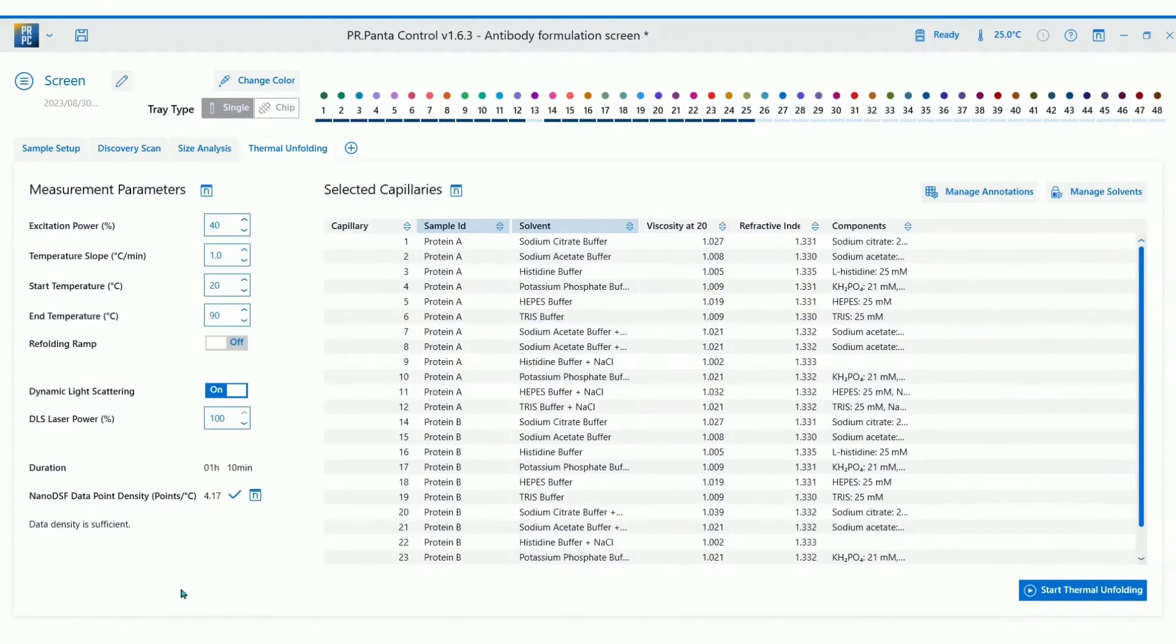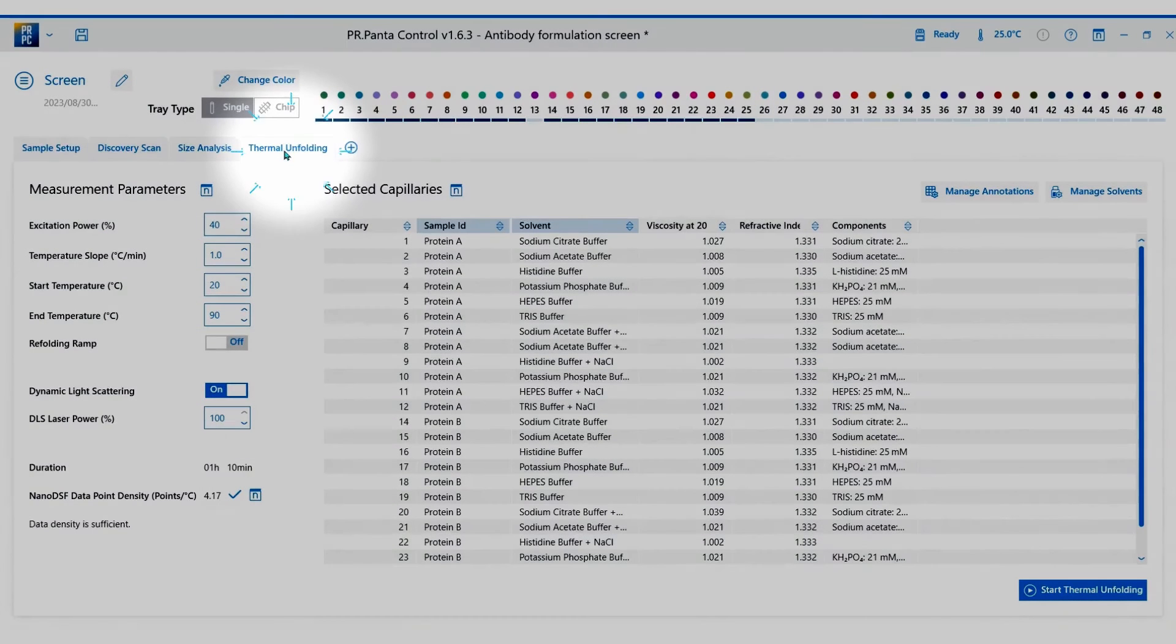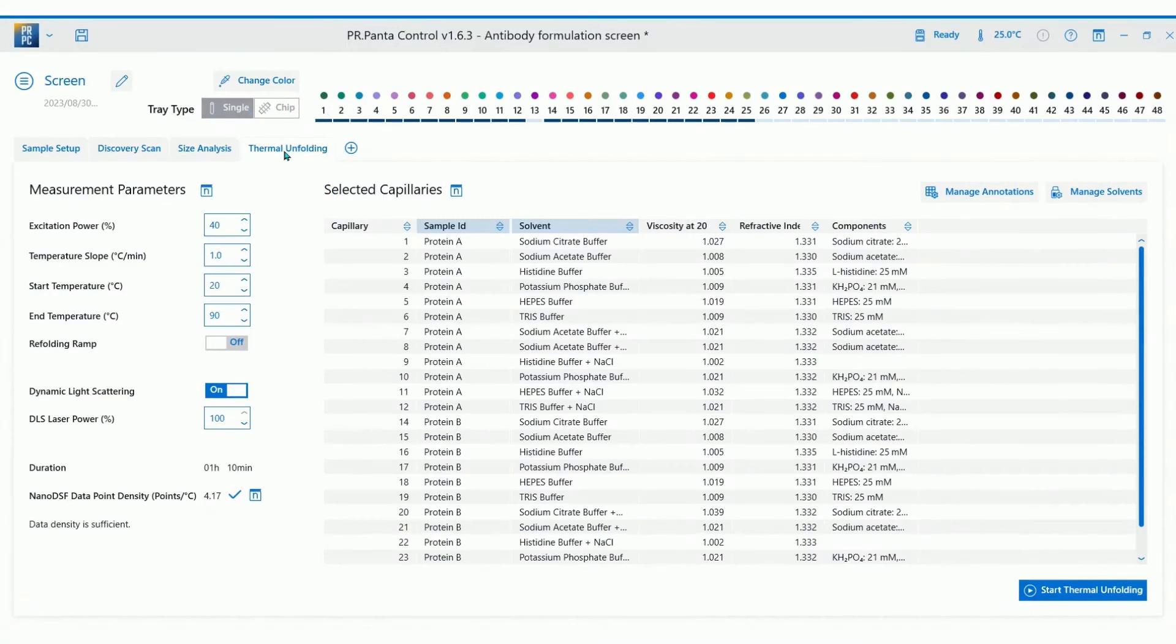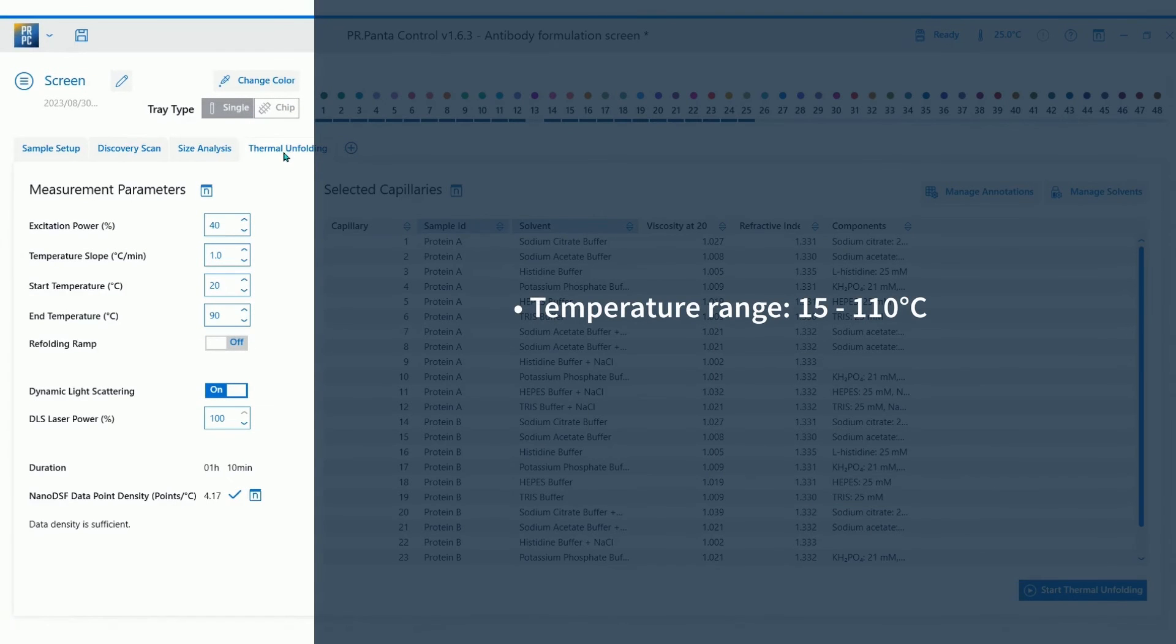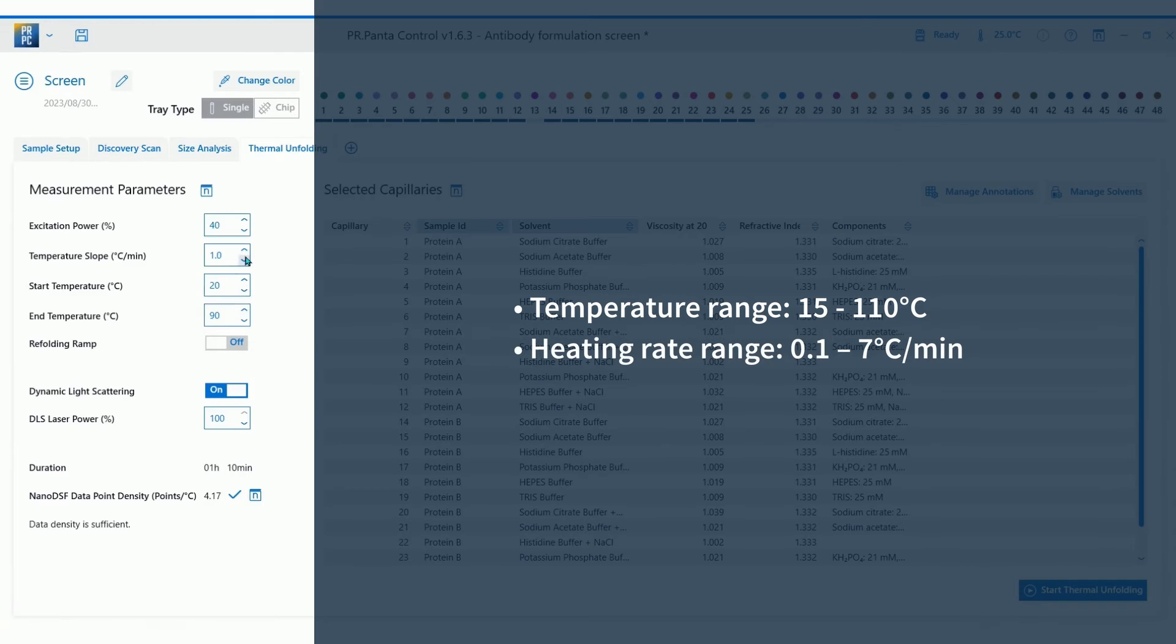You'll see that I am using the same samples that I ran for the size analysis and it has added another measurement tab to the experiment. As before, input your settings. The thermal ramp is customizable with options to run from 15 degrees up to 110 degrees and at a rate of 0.1 up to 7 degrees per minute.